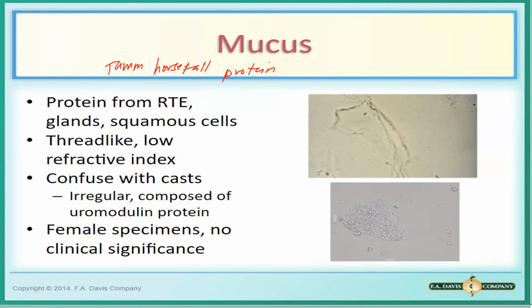Okay? Commonly confused with cast, more frequent in females. Okay? It has no clinical significance. So, most frequently in females kasi magkamukha po yung mucus from the urinary tract and mucus from vaginal tract. Okay? So, it has no clinical significance.